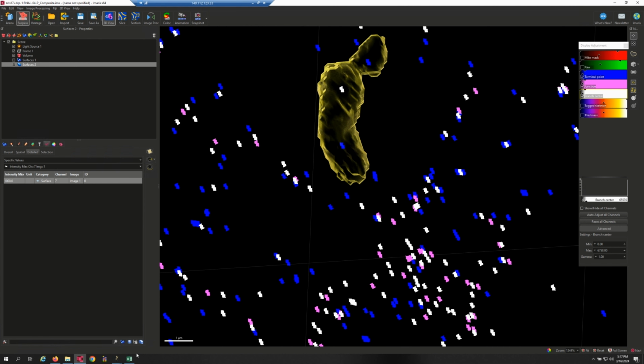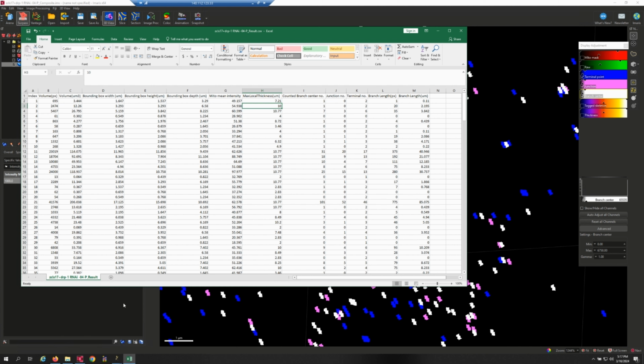Alright, looking at it this way, it seems like all our current calculations are correct. So you can run through each file and check. Then, if there are any other issues, we can discuss them further.